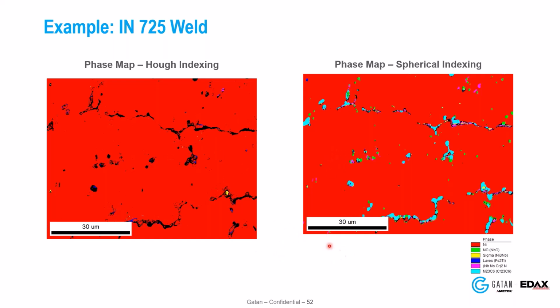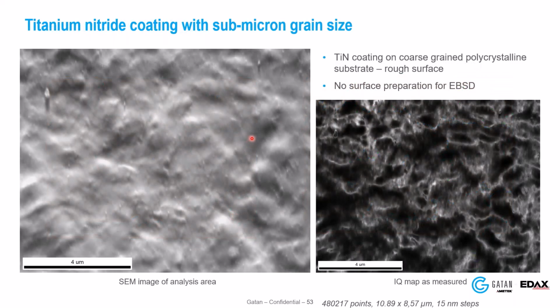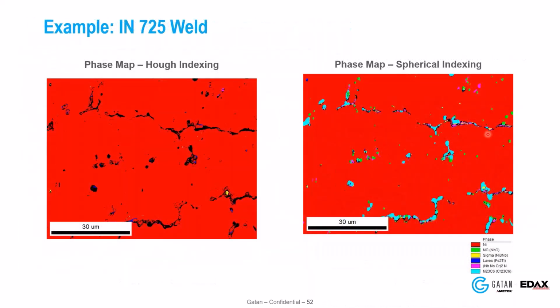Another application here: you'll notice at times I'm going to talk about sample prep and no sample prep. I'm always a big believer in sample preparation. This was a customer sample that was sent in, and they had done EBSD before, so I want to show you what you can do without doing sample prep.